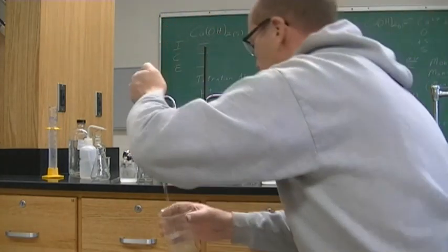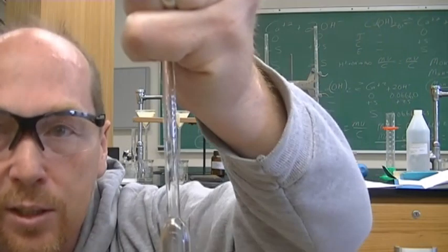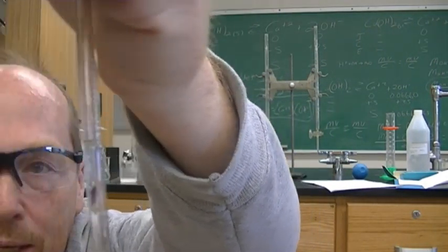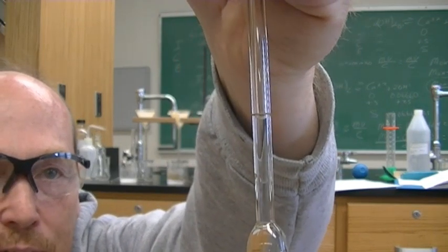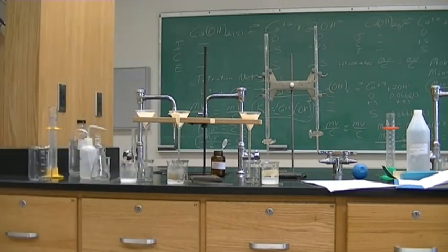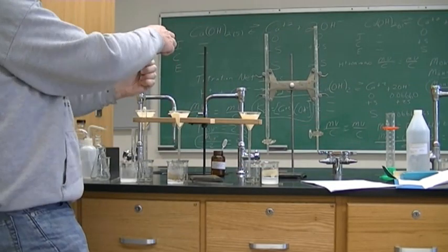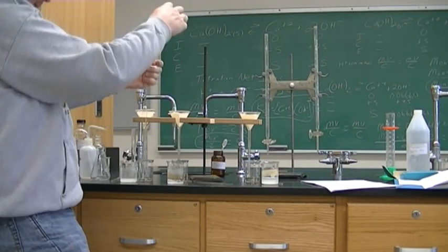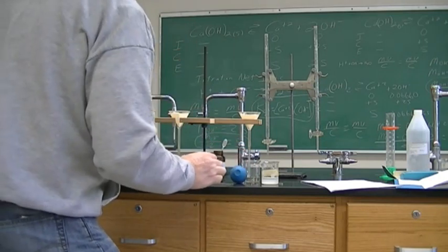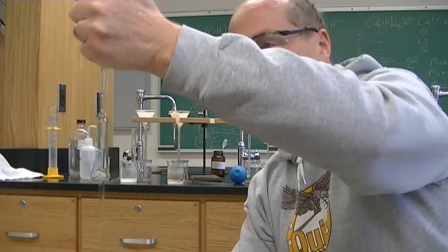Ooh, and too much. All right. So I am a tiny bit off. It is just underneath it by a tad. All right, so we want to do this perfect, so I'm going to suck up some more. And this is showing why nobody likes to do a pipette. It is very difficult to release slowly and get that right on the meniscus.